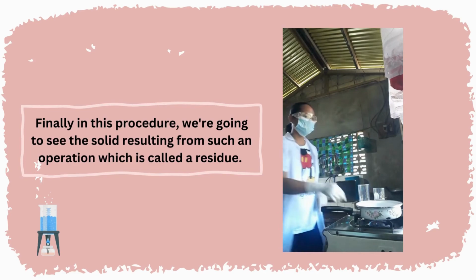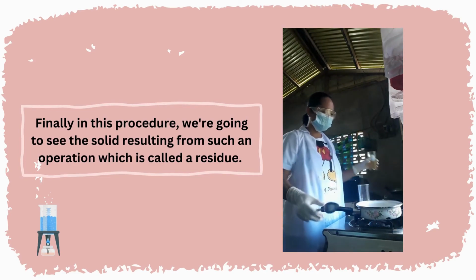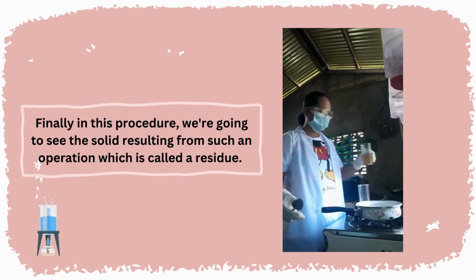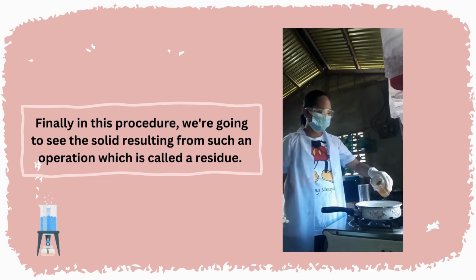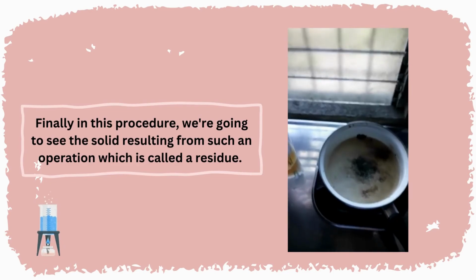So let us turn on the fire in low heat to avoid burning, and we are going to pour the filtrate, then followed by the water with the salt in it. Use a spoon to scrape. Slowly heat the filtrate to allow the liquid to evaporate.